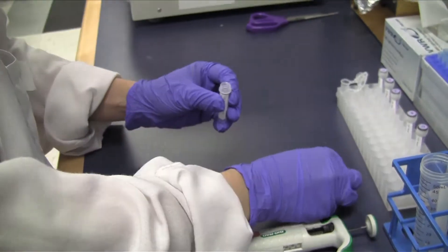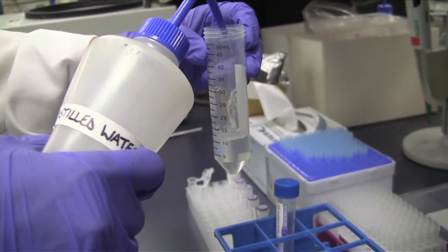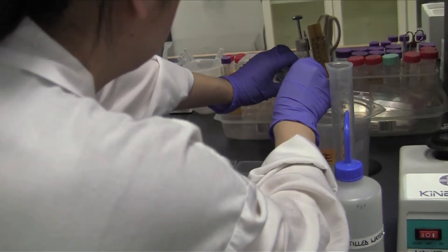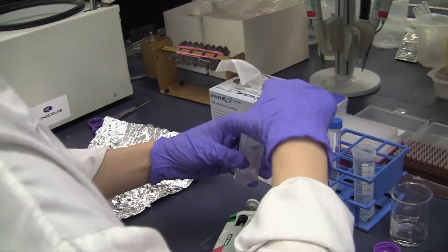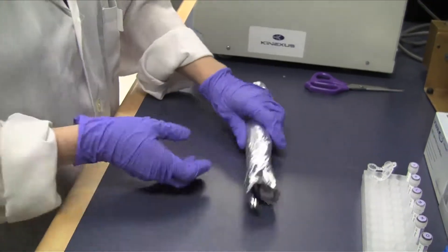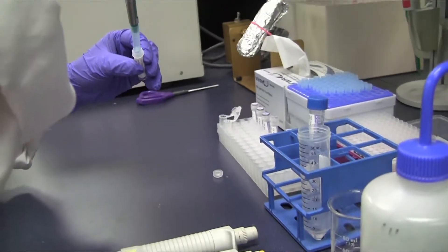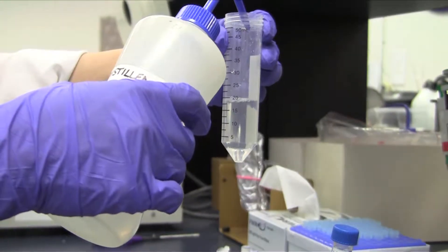Dilute the 12x Wash Buffer 2 part CAM-M in water to a final volume of 20ml. Pour out Wash Buffer 1 and refill with Wash Buffer 2. Wash the microarray for five minutes on the rotator. Dilute the 12x Wash Buffer 3 part CAM-N in water to a final volume of 20ml. Pour out Wash Buffer 2 and refill with Wash Buffer 3. Wash the microarray for two minutes on the rotator.